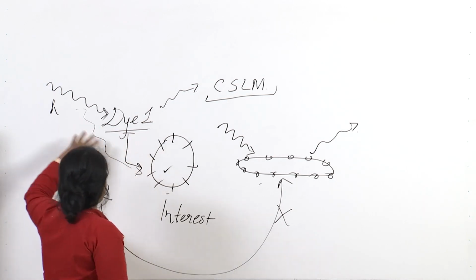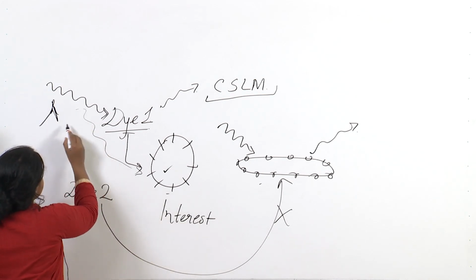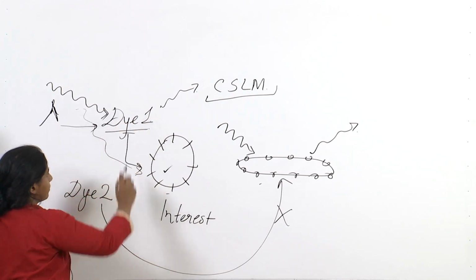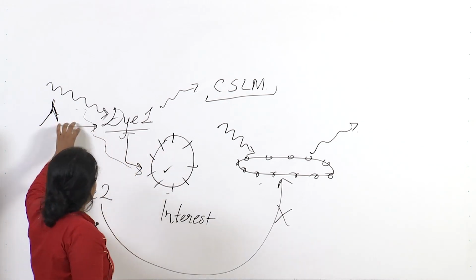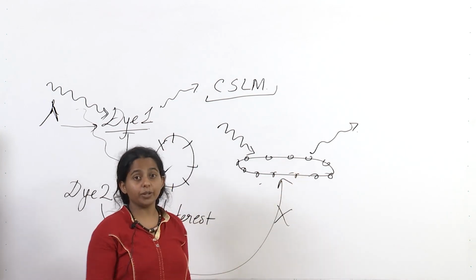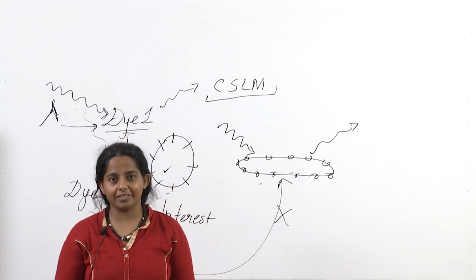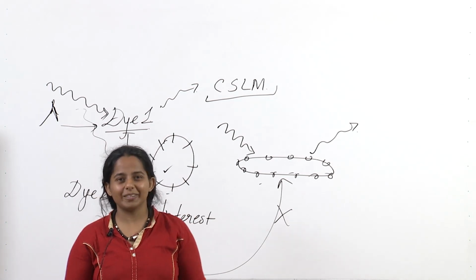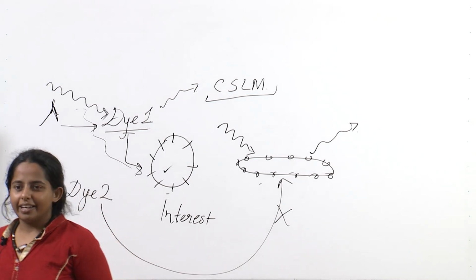What this implies is that I have a laser light and I put a filter that selects for this particular wavelength that fluoresces dye 1, then I will get an image for this bacteria, and when I change the filter, it will illuminate this other bacteria, and thus I can capture both microbial communities, tell them apart, and actually even see how they interact with each other. And this is the exact reason, the precise reason, why confocal scanning laser microscopy is very popular.